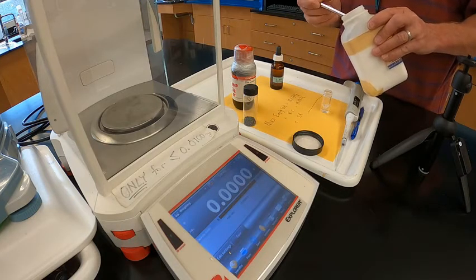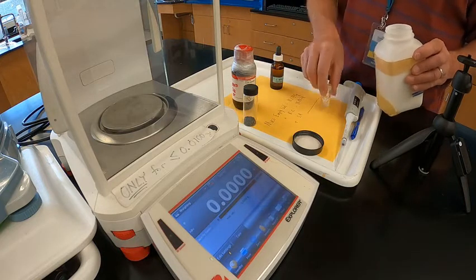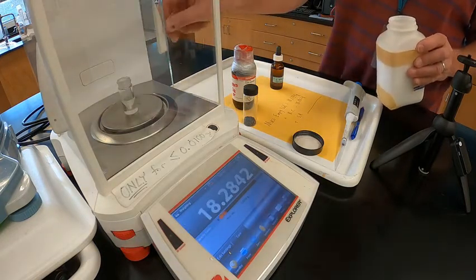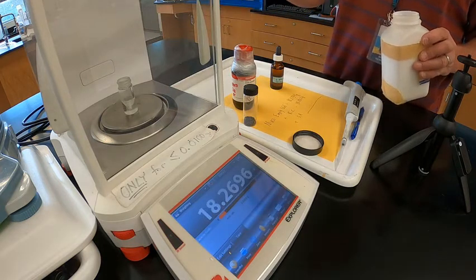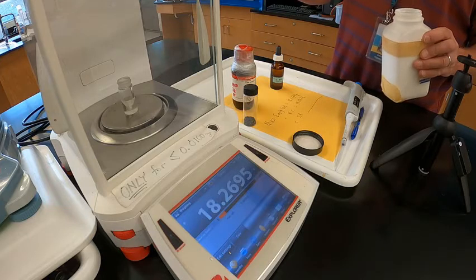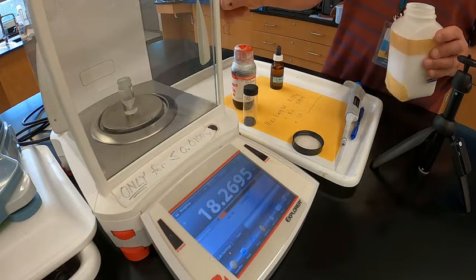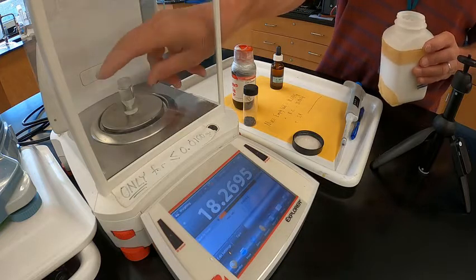It's okay to go a little over or a little under, as long as you record exactly the mass that's in there, so later you can calculate the percent yield. Now I have about 0.07. I need a lot more.